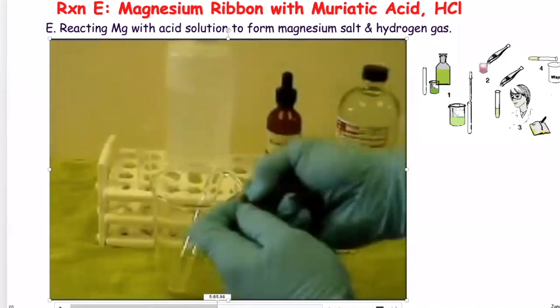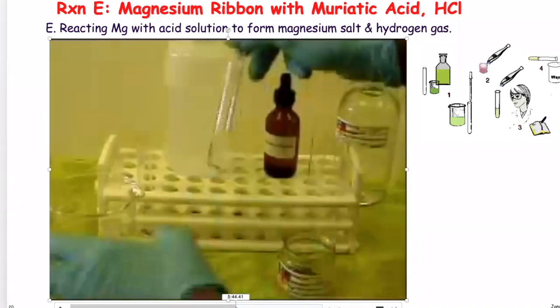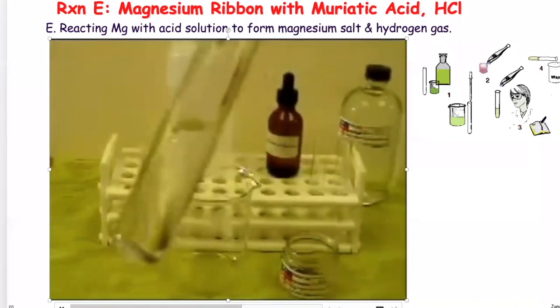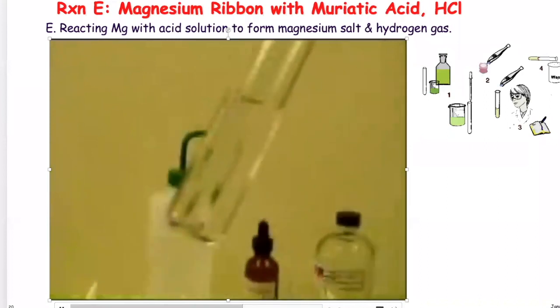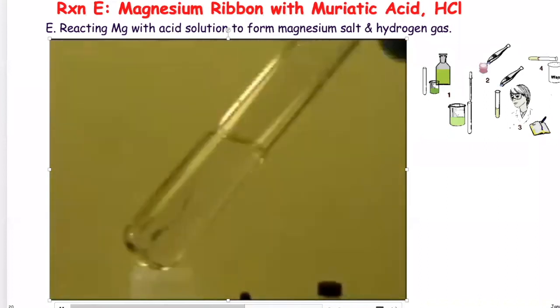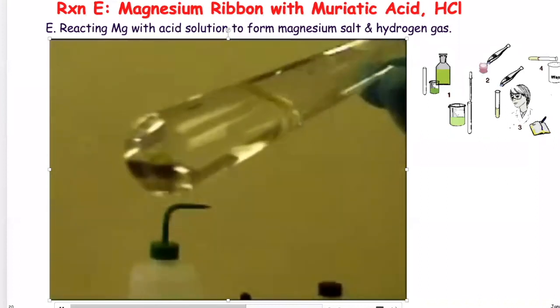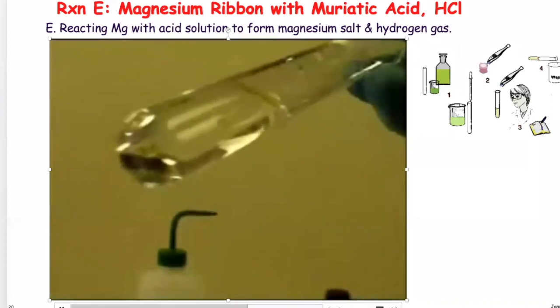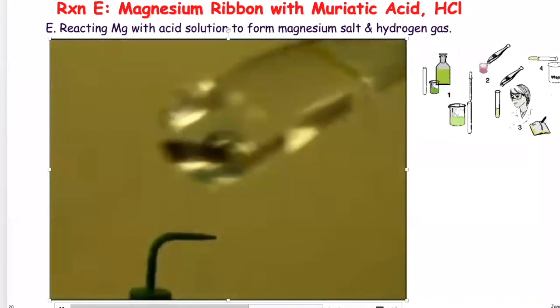Here you can see that with water, it's turning the solution a little bit pinkish. Not a lot, but enough. And then with the acid, you should start to see bubbles.